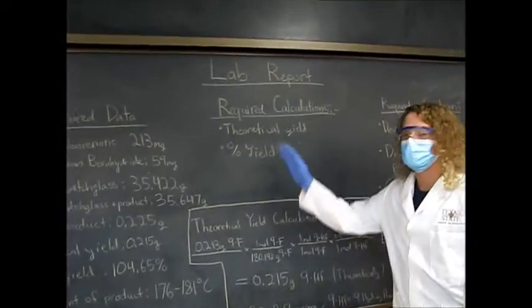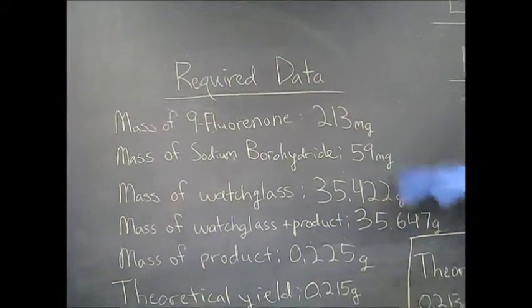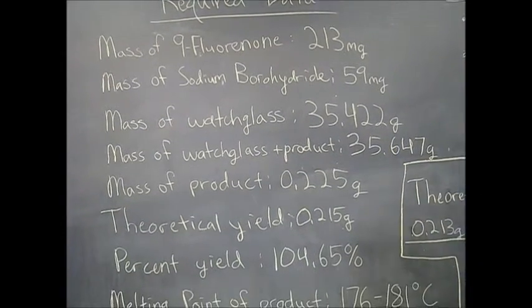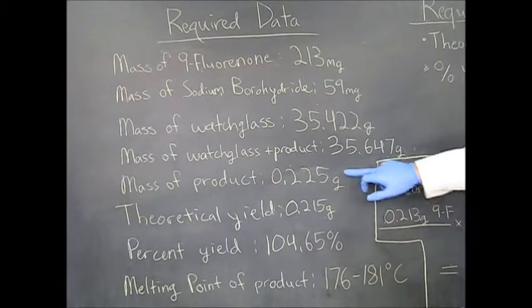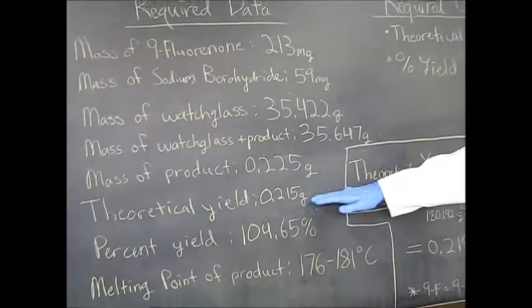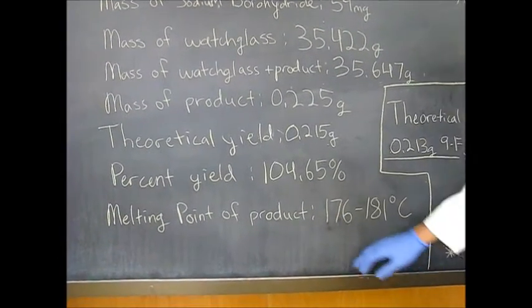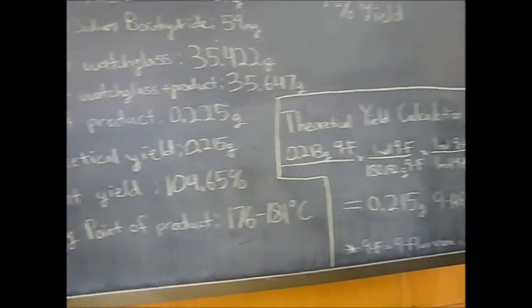Whenever you're writing your lab report, these are all the required data points that you need. These will not be your data points. This is just what we had, so this is just an example. We'll actually give you data for each of these so you can do your own calculations. But just to hit the important stuff, we got 225 milligrams of our product. Our theoretical yield was 215 milligrams. So that gives us a percent yield of over 100. We'll talk about that here in just a second. And then like we just showed, our melting point was 176 to around 181.